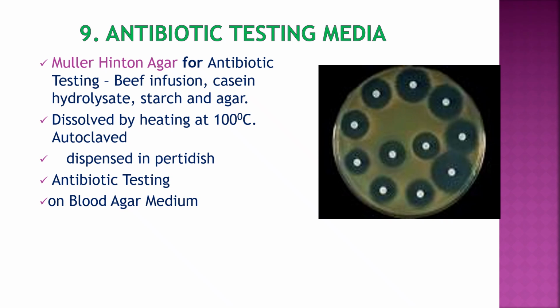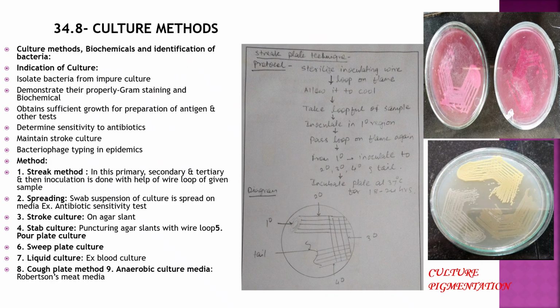Antibiotic sensitivity testing is done on Mueller-Hinton agar, and that is usually done by the Kirby-Bauer disk diffusion method. Media streaking on the plates is done this way.